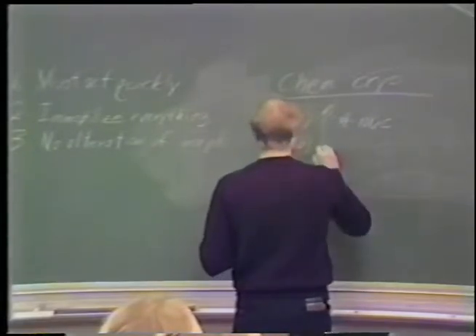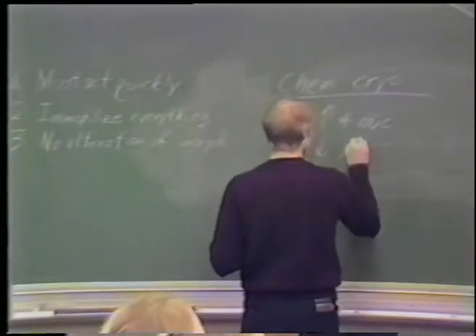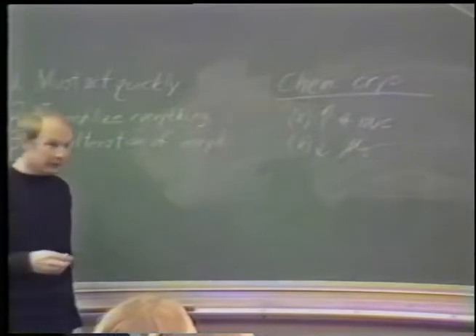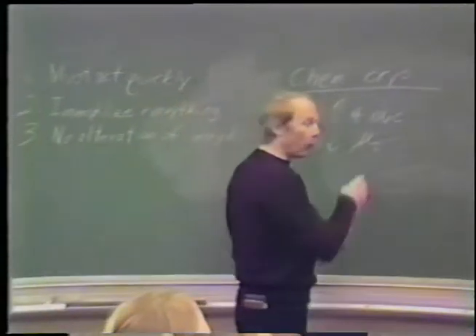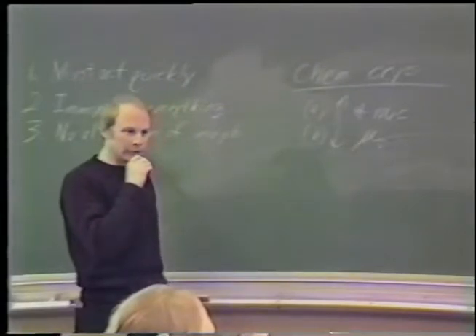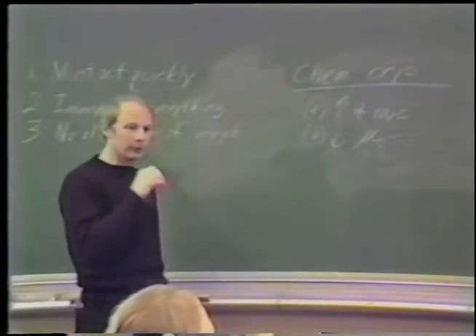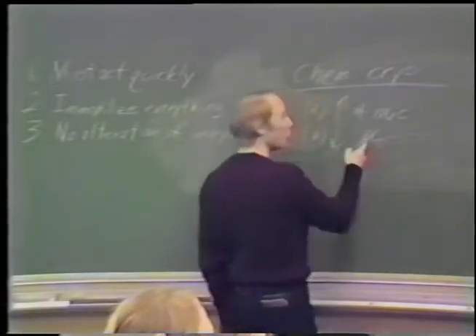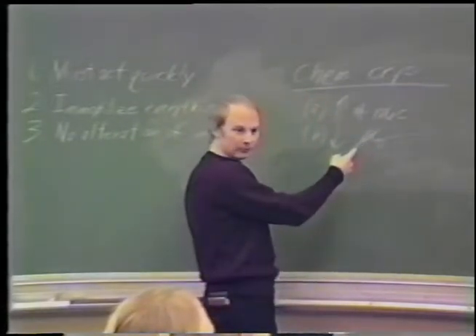You can also decrease the chemical potential of the water. And this makes it less favorable for the water to enter the ice lattice, even though it's still of lower energy, as the energy is not that much lower than the aqueous condition. So this will slow the growth of ice crystals.